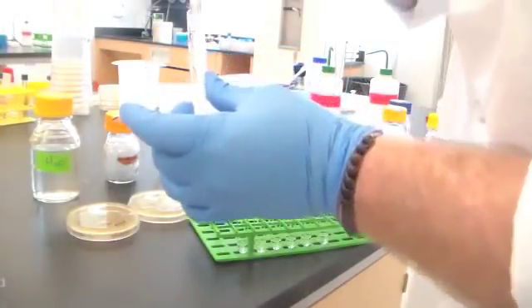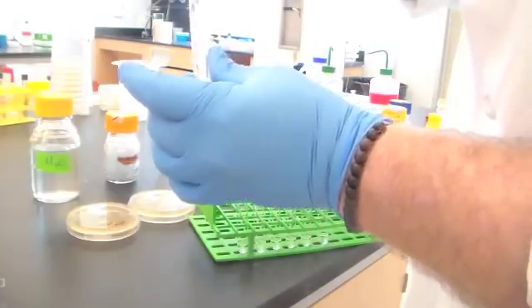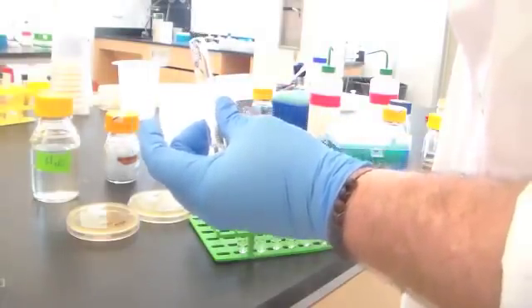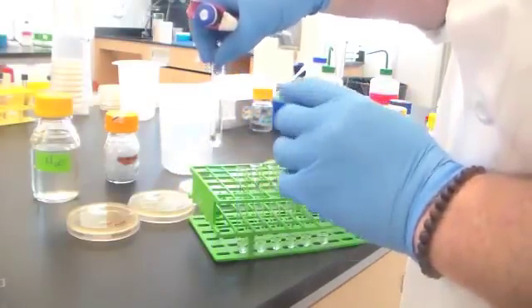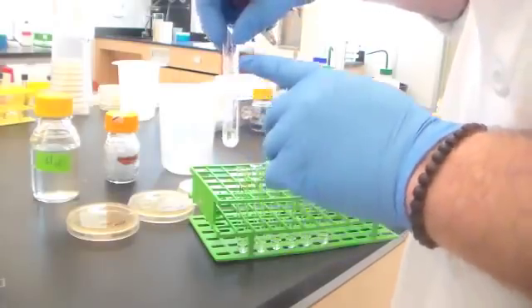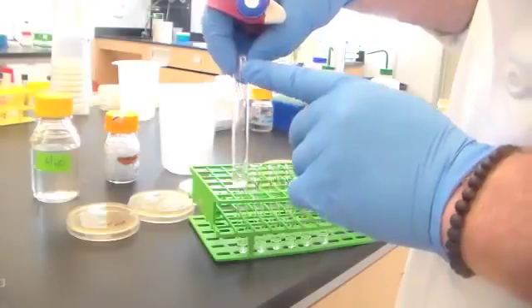And then I'm going to triturate or pipette back and forth to rinse the bacteria out of that. I go down to the second stop to make sure I've gotten rid of the last drop. I pull that out, and now very importantly, I get rid of that pipette tip. It's very important that you change pipette tips between every one of these dilutions. This is your 10 to the minus 1 or 1 to 10 dilution.